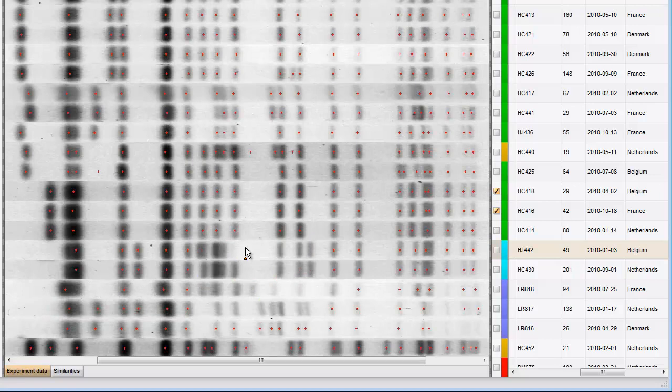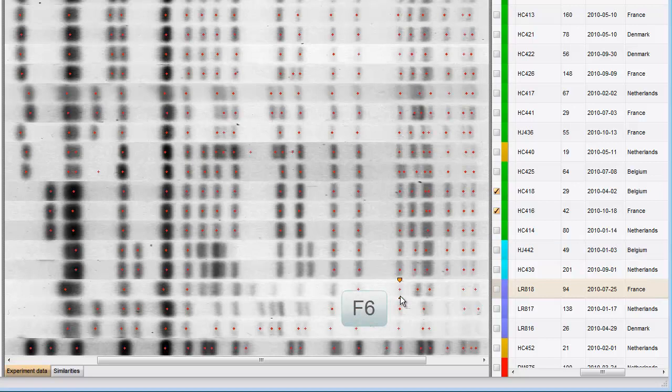Uncertain bands can be changed into certain bands by selecting them and pressing the F6 key. And certain bands can be changed into uncertain by pressing F5.